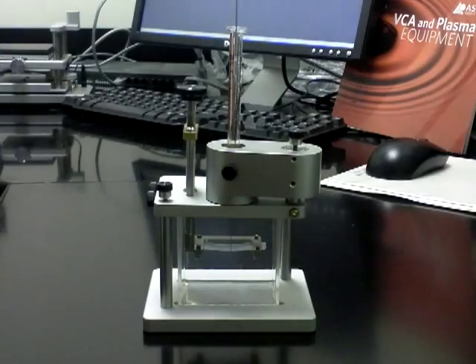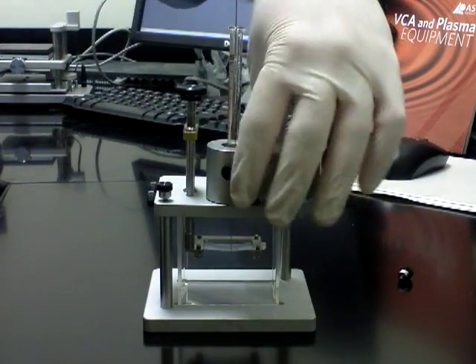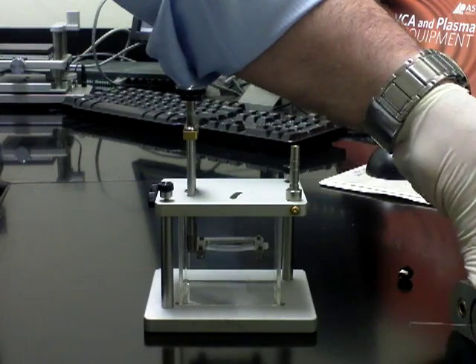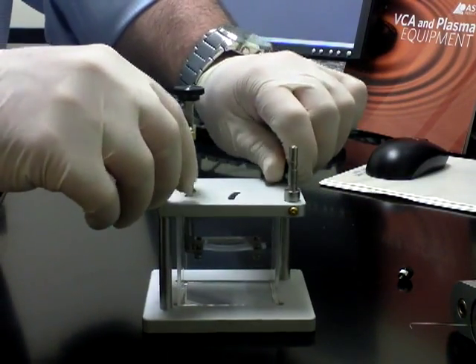I'm now going to prepare the captive bubble accessory for the VCA Optima stage. First thing we do is remove the syringe, taking out one screw, and the whole syringe holder will come out. Then we remove the top of the captive bubble by taking out the two screws on each side.